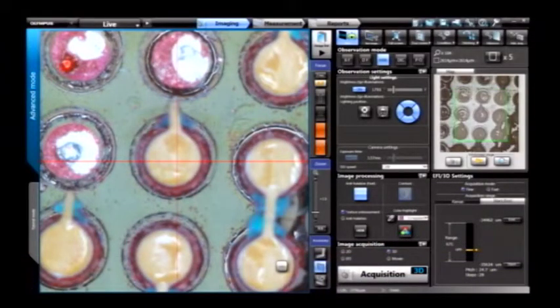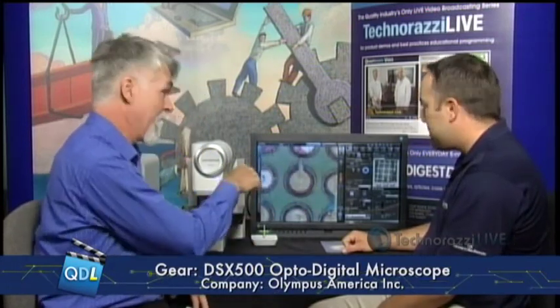The touchscreen has a built-in opto-digital zoom feature. Similar to pinch-to-zoom on an iPhone or iPad, this works the same way — but when you perform the optical zoom, you're actually controlling the optics mechanically, not digitally zooming, so you're not losing resolution. We can optically zoom to get very high magnification ranges using just one objective. We still use our world-class UIS2 optics from Olympus, and Olympus also specifically designed lenses for this microscope.